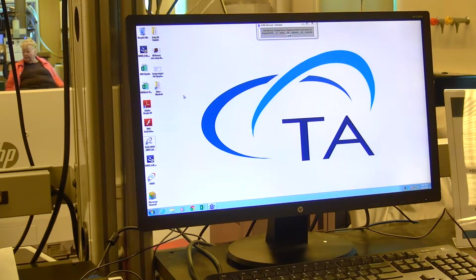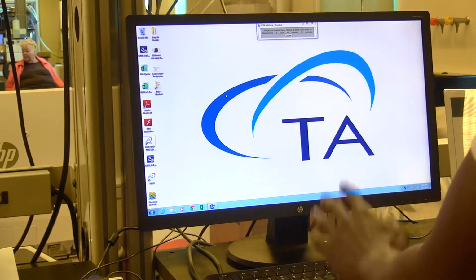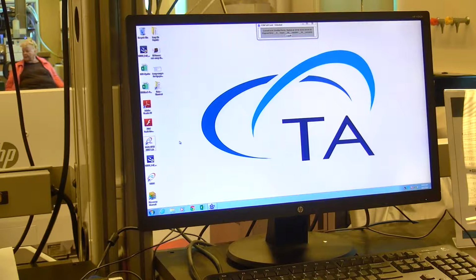All right. So once you're on the right computer, you sign in. The software is located right here. It says TGA 1-0253 at IceLab. This is basically the serial number of the instrument. And you basically double click on this icon to open up the Trios software.